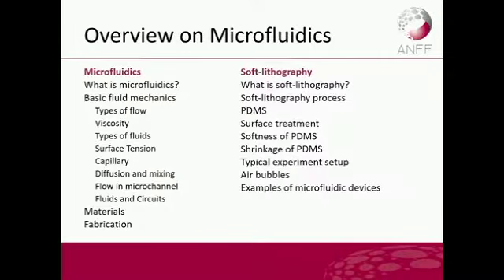So this is an overview of what we'll be covering this afternoon. Initially, we'll talk about microfluidics, and then we move on to soft-lithography. Under microfluidics, we'll go into an intro of what it is, the basic fluid mechanics involved, the type of materials and fabrication process that you'll encounter if you're dealing with microfluidics.